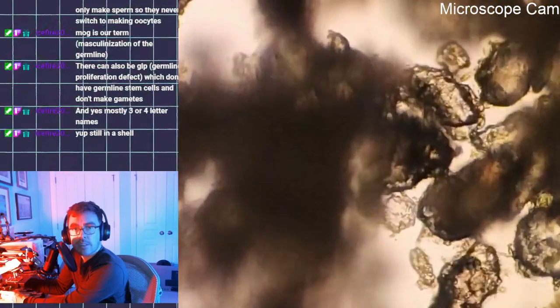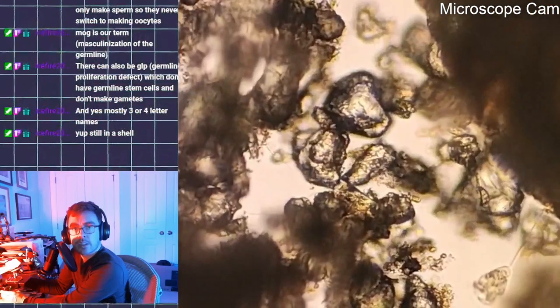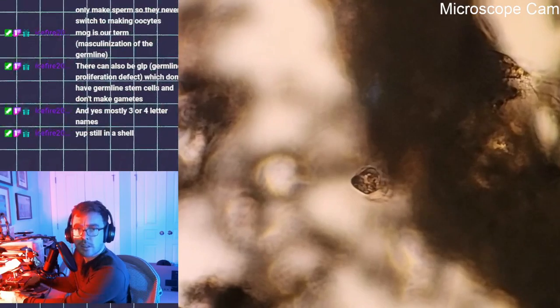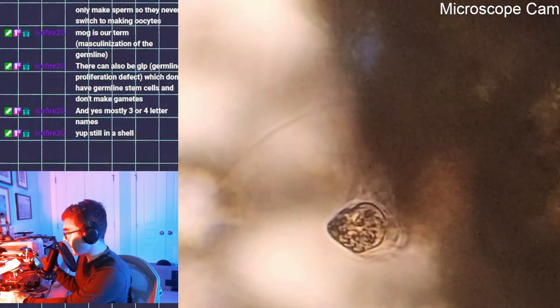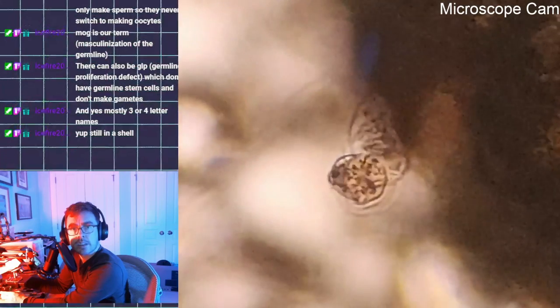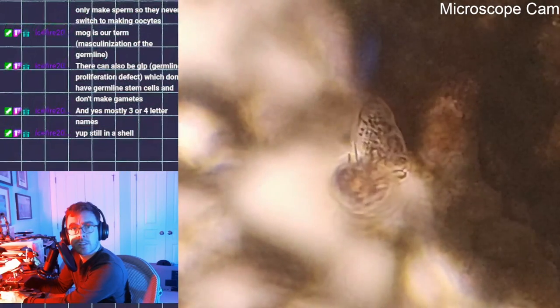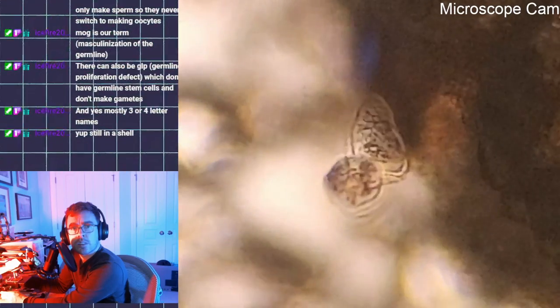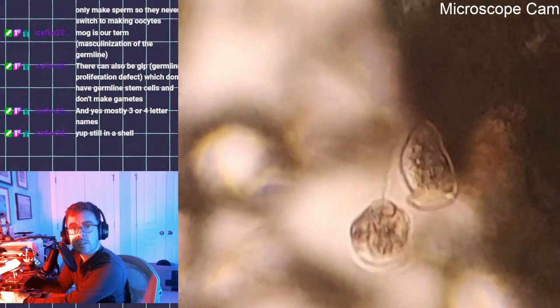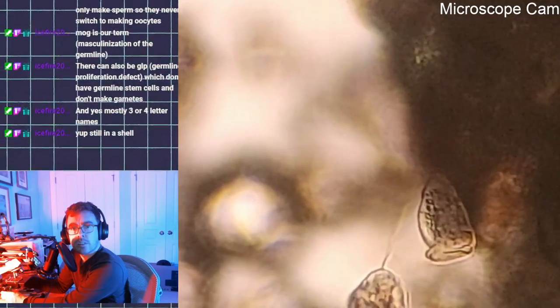The sand is really pretty to look at. You can actually see that there is a little bit of a mix of maybe some algae in it. This is something. It needs to move a little, but is this a vorticella? It's kind of in the wrong plane for me to tell exactly. Yes. Wait, actually, I think it's a vorticella and a stentor. I think they're very close to, oh, there we go. Very close to one another.